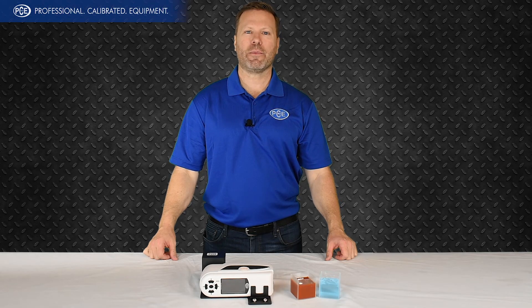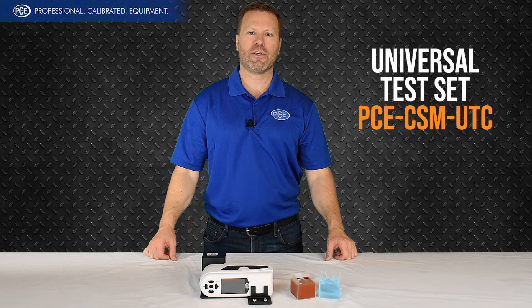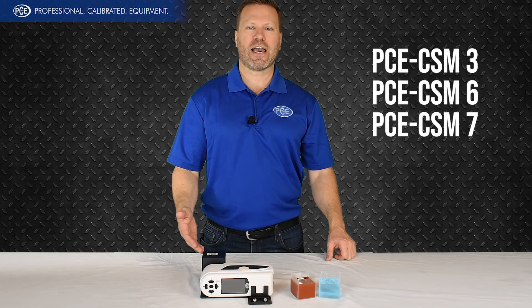Hi, I'm Andy with PCE. Today we're gonna be looking at the Universal Test Kit. It's used for checking liquids and powders. This works with our CSM3, 6, or 7.